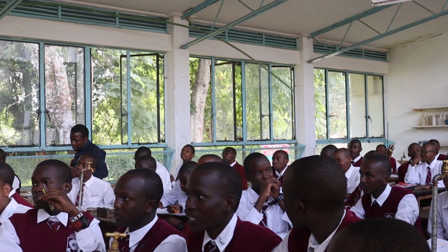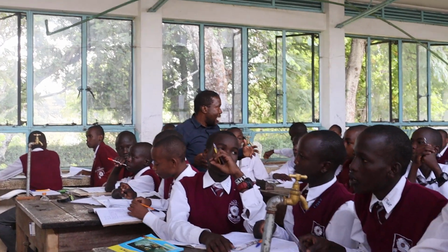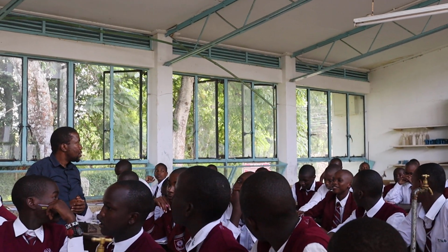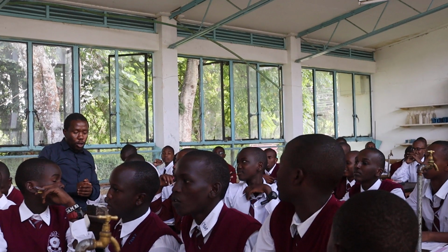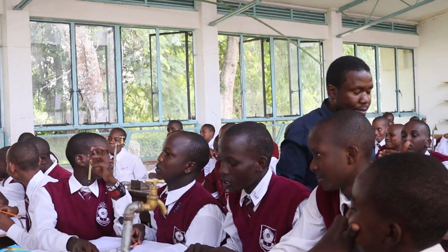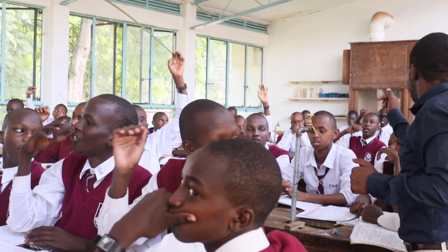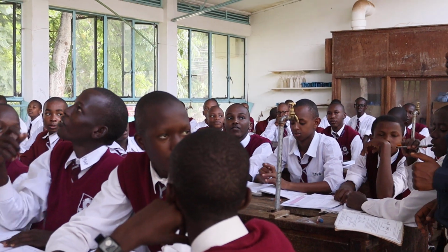Very good. Now, based on those observations or those characteristics, does anyone have a question before we proceed? Yes? Teacher, I wonder what's the name of this type of flame? Very good question. Jeremiah is wondering what is the name of that type of flame, the name that those characteristics belong to. Yes, very good. According to me, it's a luminous flame. Yes, it is a luminous flame.